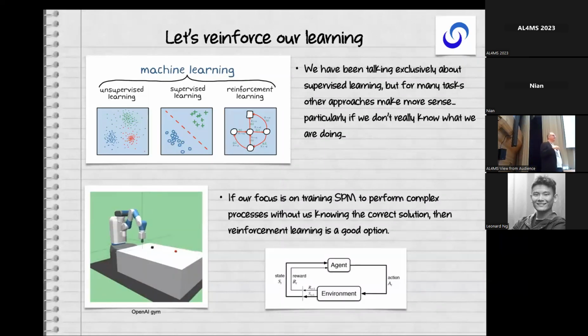So this is the idea that you train an agent with rewards or punishments to do a task, and gradually it learns to do this task very efficiently, unlike this robot arm here. But already in my mind, when we saw this robot arm, it's very easy to reimagine this as a scanning probe microscopy tip trying to move atoms on a surface.